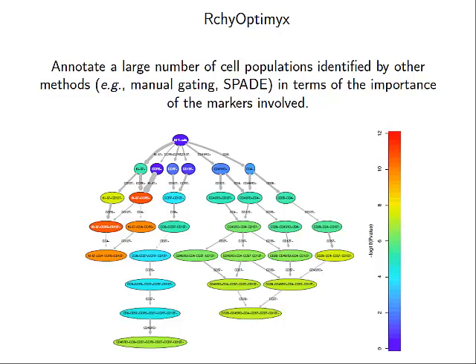Then you go to manual gating, and you actually see, oh, there's another population right there that was grouped together, but it's still distinguishing that. And we've found that before. You can go back and look at this by hand. You're not going to just trust this. And so we may not get you the right population, but we'll get you close in high-dimensional space.